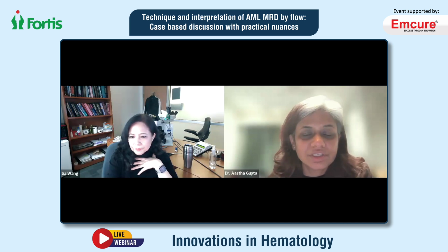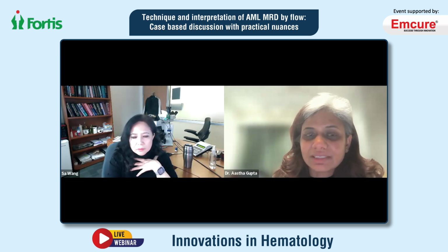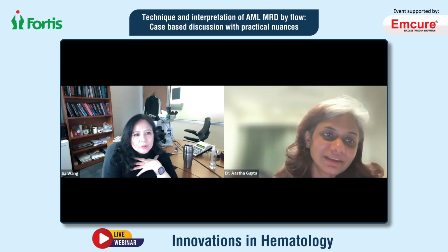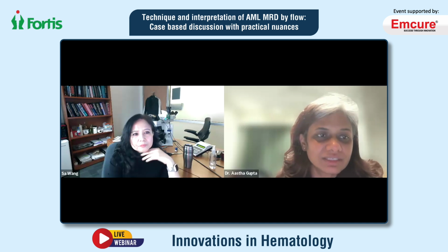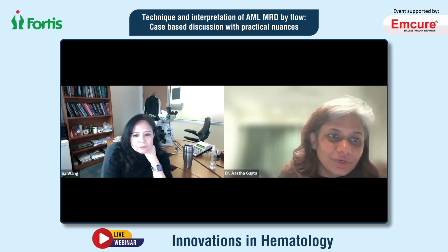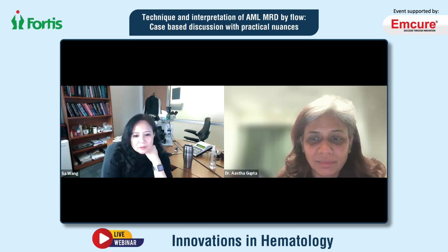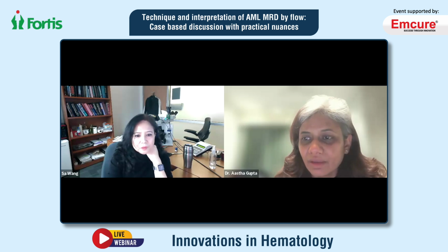Okay, we have a question by Dr. Pratyush: please suggest the best antibodies, in your experience, which can be used to differentiate CD34 positive, CD38 negative normal hematopoietic stem cells versus leukemic stem cells. In the beginning you showed the proposed antibody panel which is coming. So what is your experience on the same, ma'am?